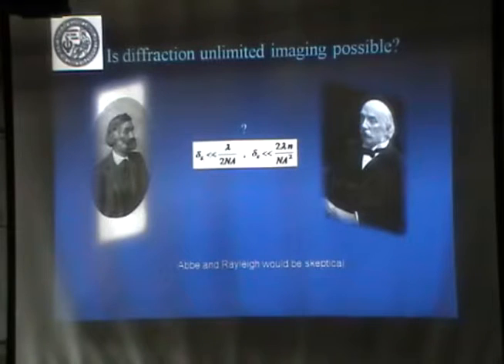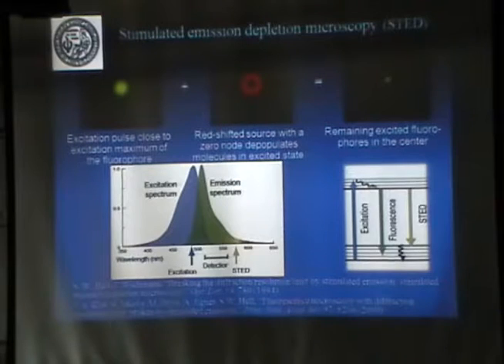What we are trying to do is the opposite of what I told you before. The design is reversed and much smaller. We are trying to do this by a lot, not by 1%. The first method that actually worked was proposed by Stefan Hell from Germany, and the idea is to use a type of scanning microscope.